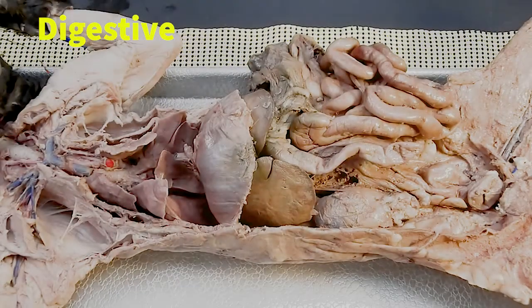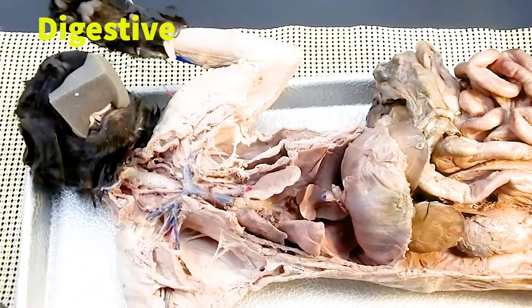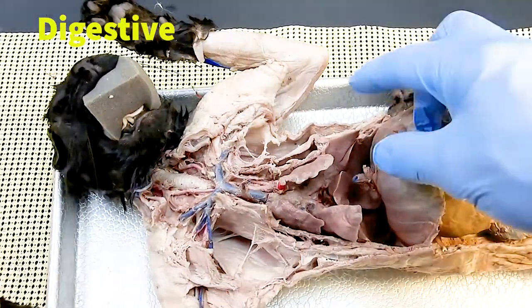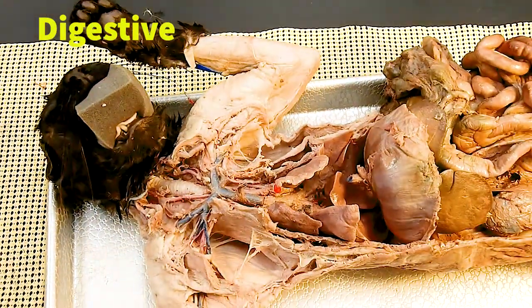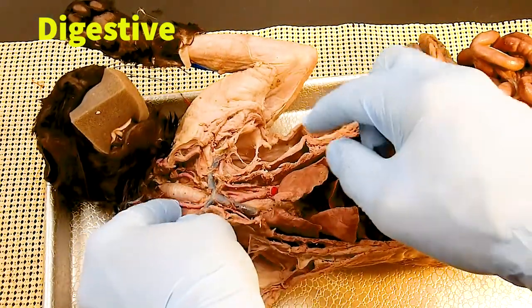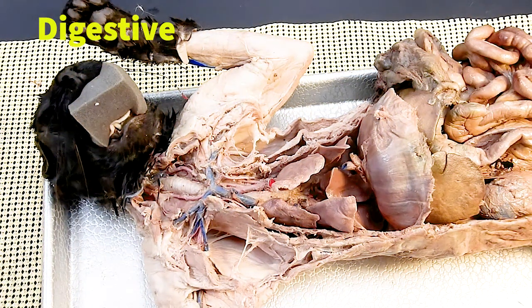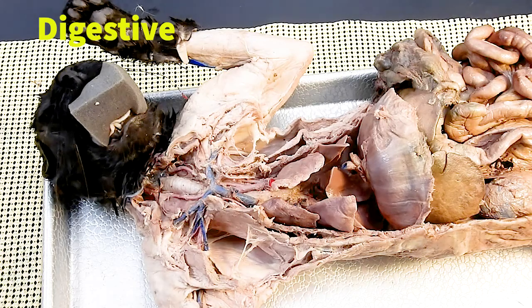All right, we will do a little bit of the anatomy of the digestive system on this cat. Now I'll start up in the thorax and bang all my stuff everywhere. Here we go. Now, we've got the trachea. There's my forceps.